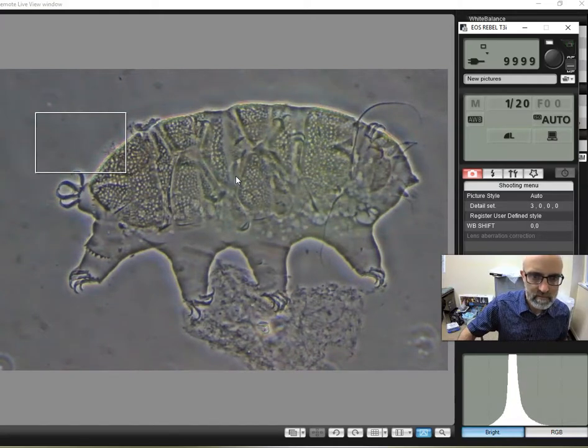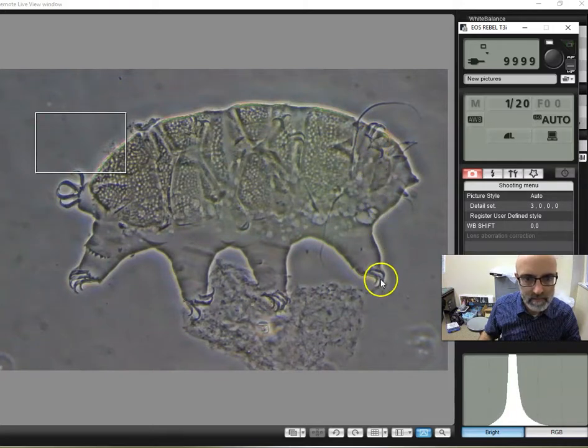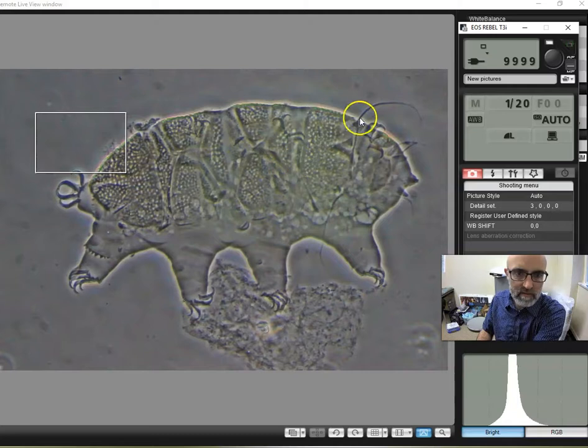That's amazing. Look at this: here their claws are paired, and you can see through the animal. These are the claws on the animal's left side, claws on the animal's right side, claws left side, right, left. There's that collar. You can see that cuticle beautifully. Oh, I like it, so I'm going to take another photo.